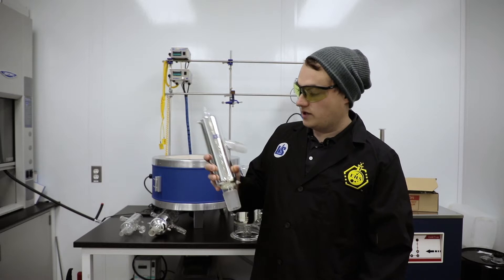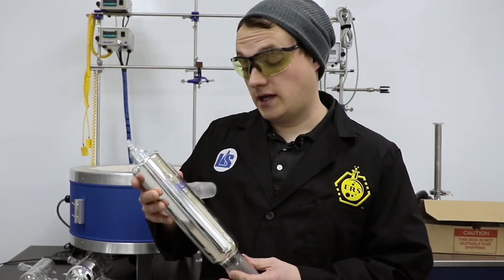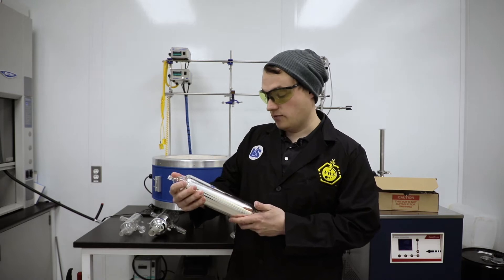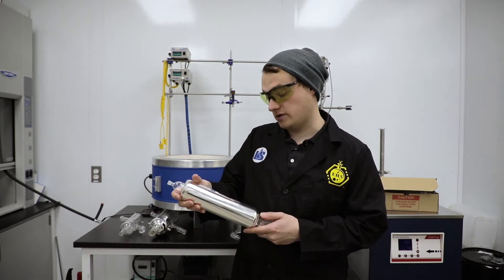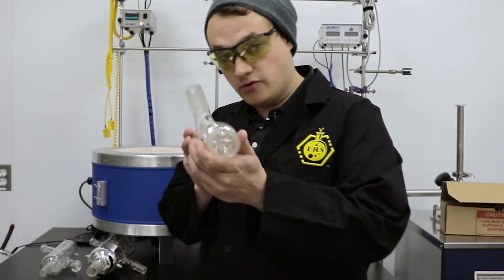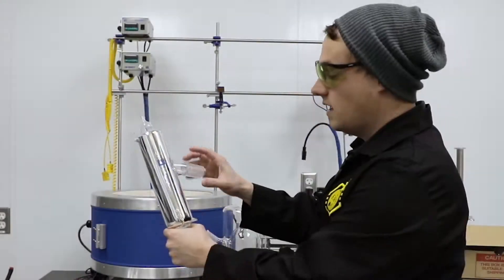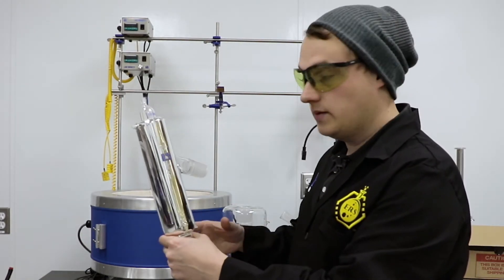This is our standard distillation head style, which is a silvered 45-50 vacuum-jacketed and silvered head. This head's great because with the silvering, we are going to retain a lot of that infrared heat, which helps bring down our distillation temps so that we can achieve better separation. Additionally, these heads are great because they're super simple. They have some Vigreux indents right inside of there that help with aiding the reflux ratio, and an enlarged discharge port so that we can get good flow rate coming out of the head.